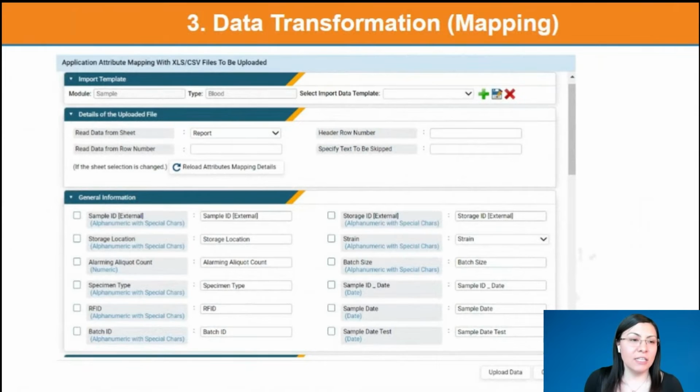Here we can see that some LIMS provide templates like this one we have here. They allow you to select each of the attributes in your tables and select the location in a specific Excel or CSV file. So for example, we can select the location in a column. You will have these alphanumeric characters, for example. So you can specify all of these in this kind of template. So this is another feature to keep in mind when looking for different LIMS vendors.